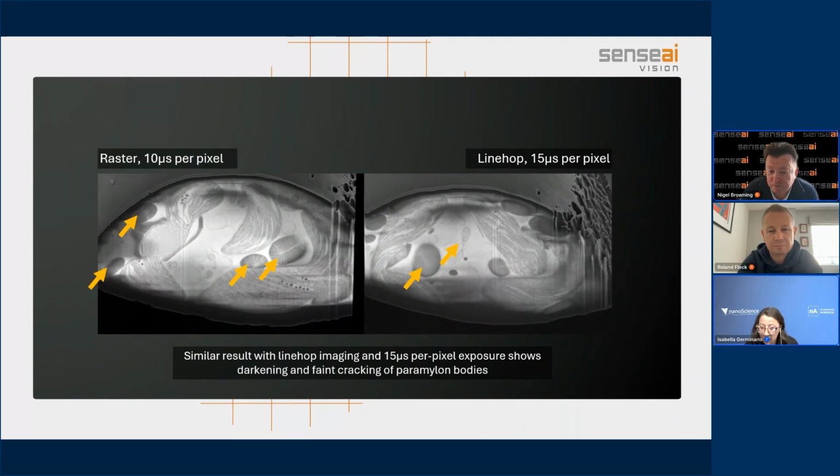Let's see what other questions we have. Does installation affect any techniques on the microscope? No, it just sits there entirely passively. If you don't turn on the scan generator, the microscope's exactly the same as it was the day beforehand. If you don't launch the software, it's just a standard SEM, or FIB-SEM, or serial block face SEM, or whatever. It's just like having a scan unit on a microscope. If you don't turn it on, it doesn't affect anything else that you're doing.